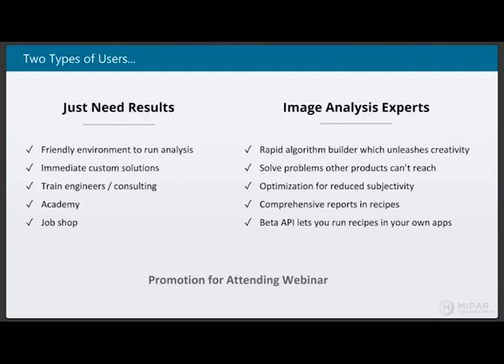Yeah, certainly. MIPAR is completely agnostic to how the images are collected. If you take a look at our applications page or our recipe store, you'll even see satellite images from Google Earth that MIPAR has been used to analyze.